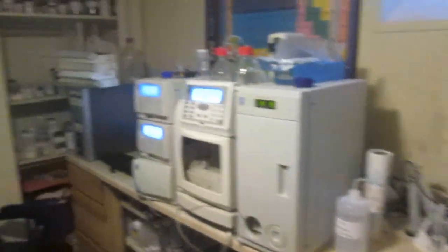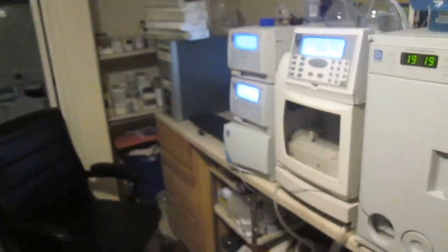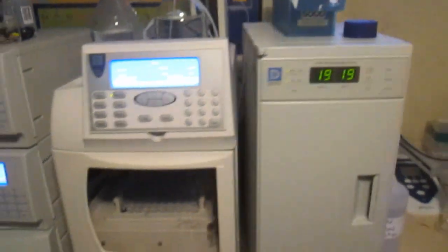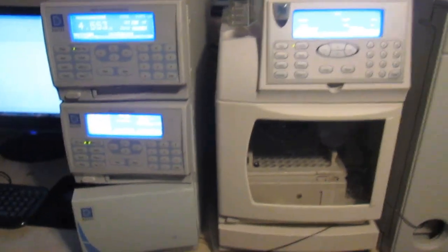Hello and welcome. Let me show you what I've been working on these last few weeks. This is an ion chromatography system I'm trying to put together for anion and cation analysis.